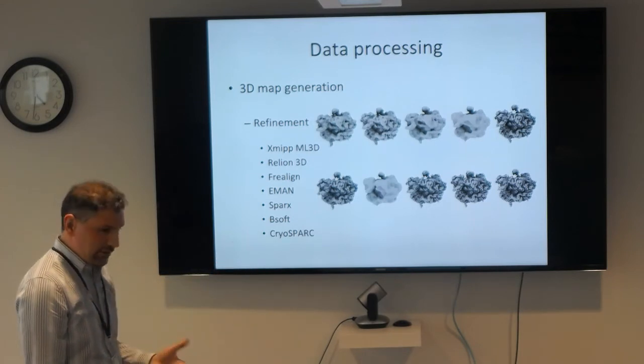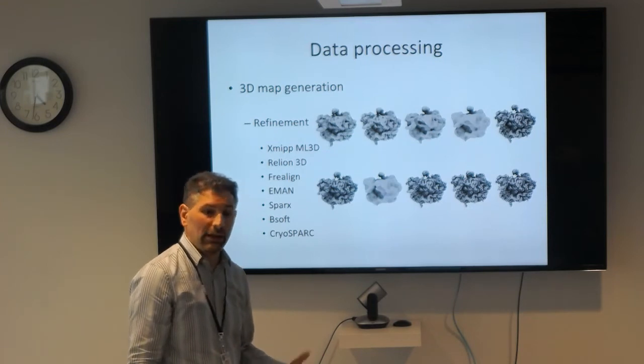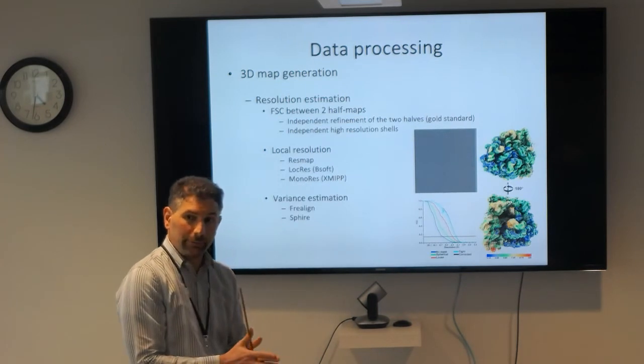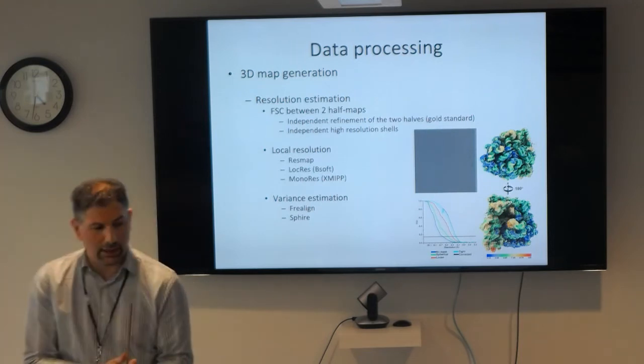And for whatever reason, in my hands, it seems to do a better job dealing with anisotropy than something like, for example, Relion. So I'll talk about anisotropy. Any questions so far? How are we doing in time? 15 minutes. Okay, I'm almost done.